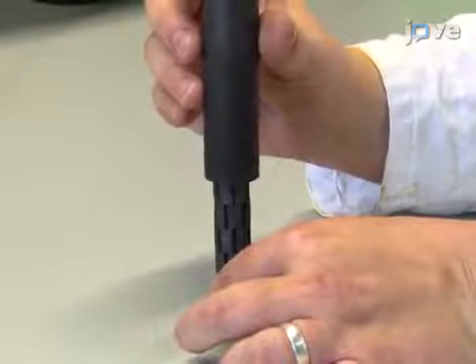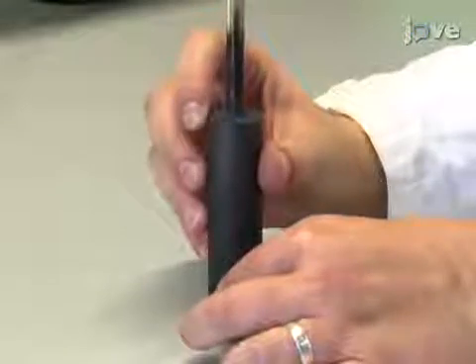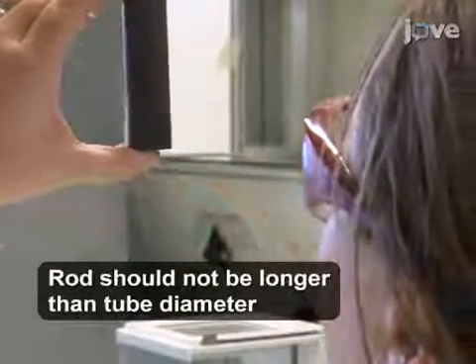Insert the stack into a hollow graphite tube so that the holes of the terminal ring fit with the holes in the graphite tube. Fix the setup with a second 0.7 mm graphite rod.